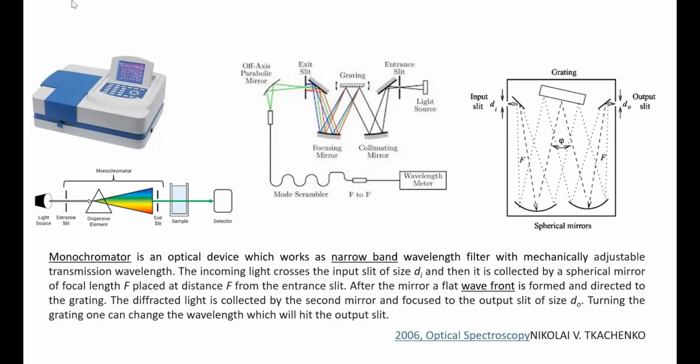What is the temperature of working? All these details are here. And this is the flap. If you open it, you will see the sockets for holding the cuvettes. Once you place the cuvette, you have to cover the lid again, this blue colored shuttle, and then you can go for starting the estimation. What are the components or design of the instrument?